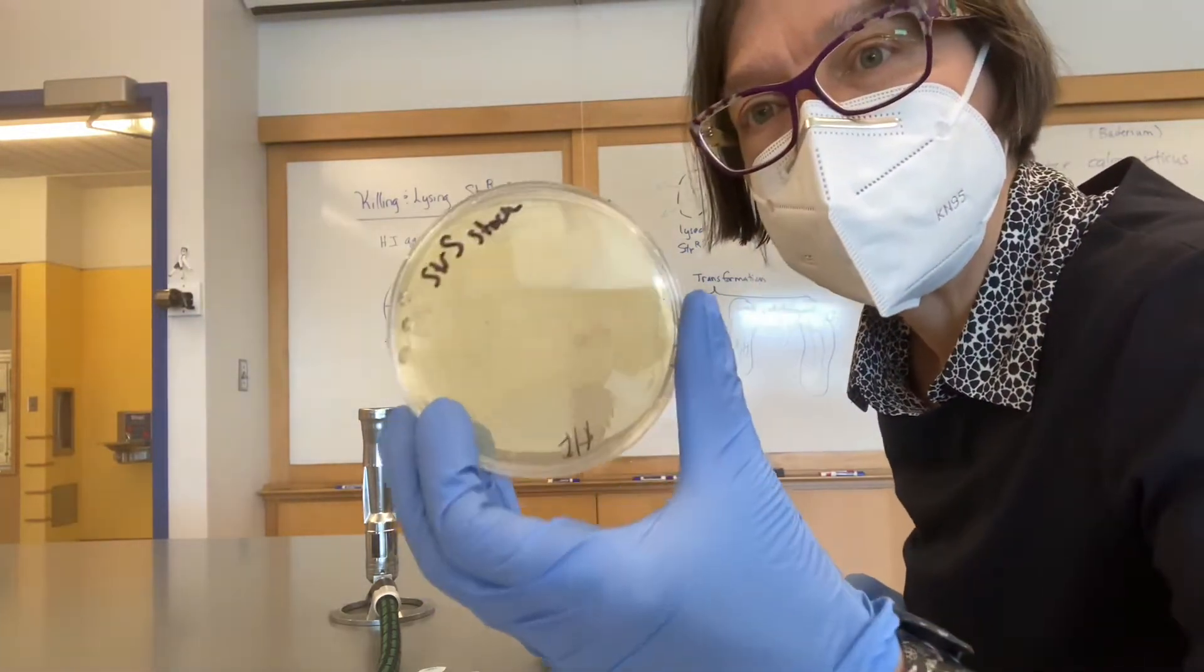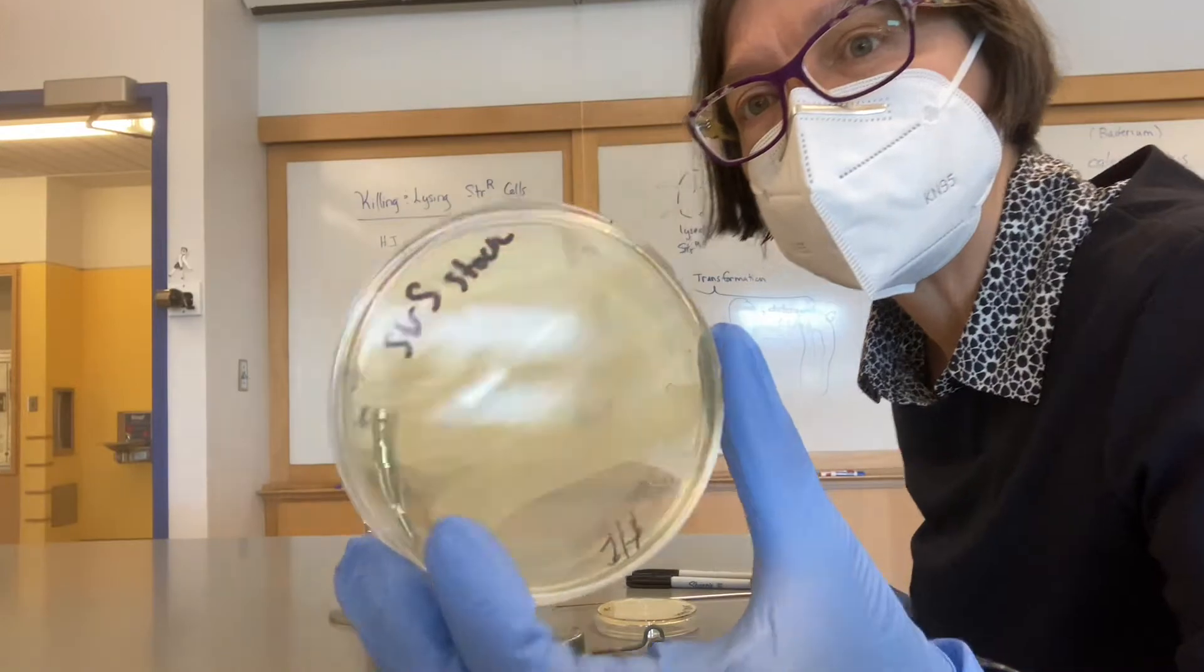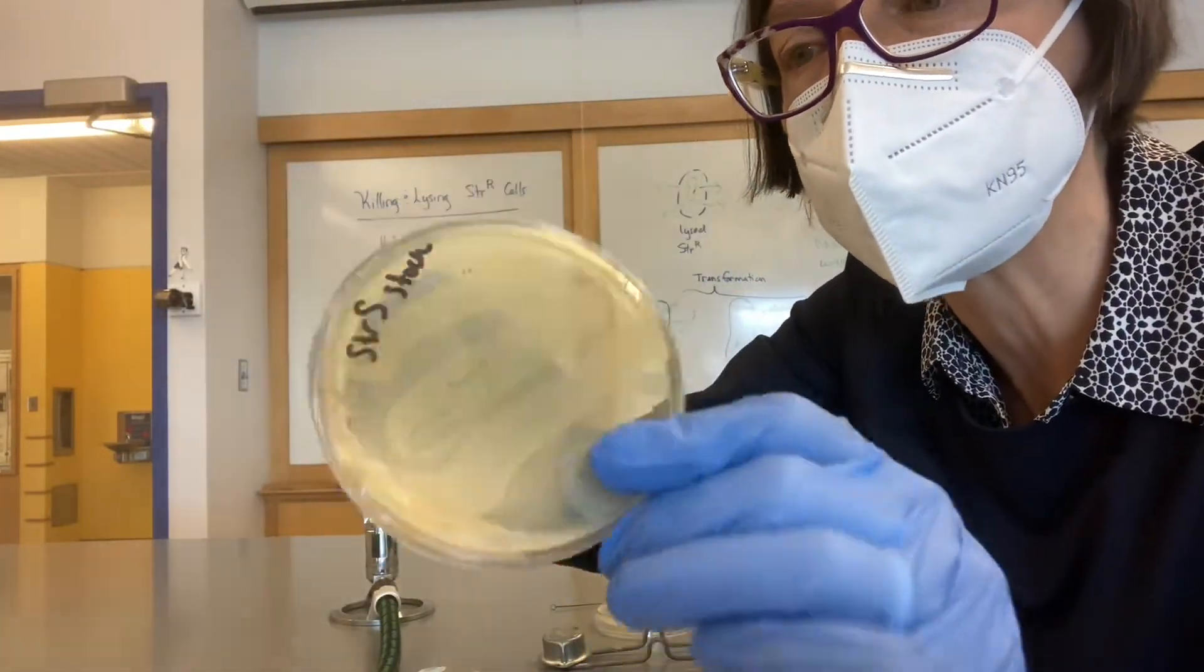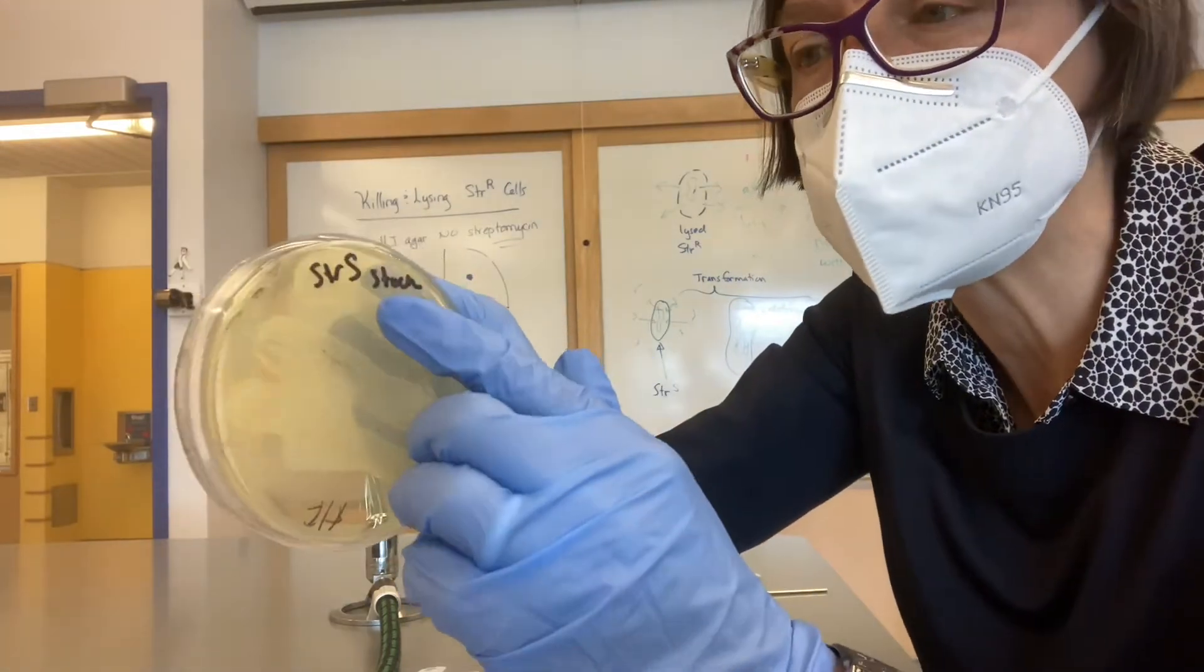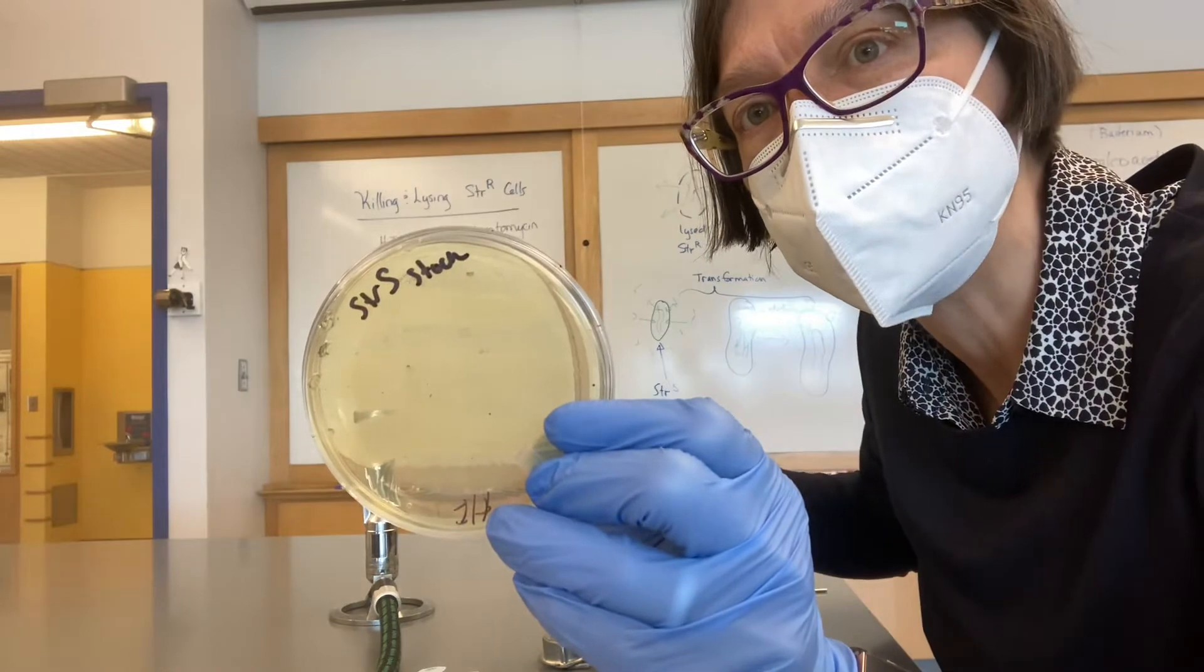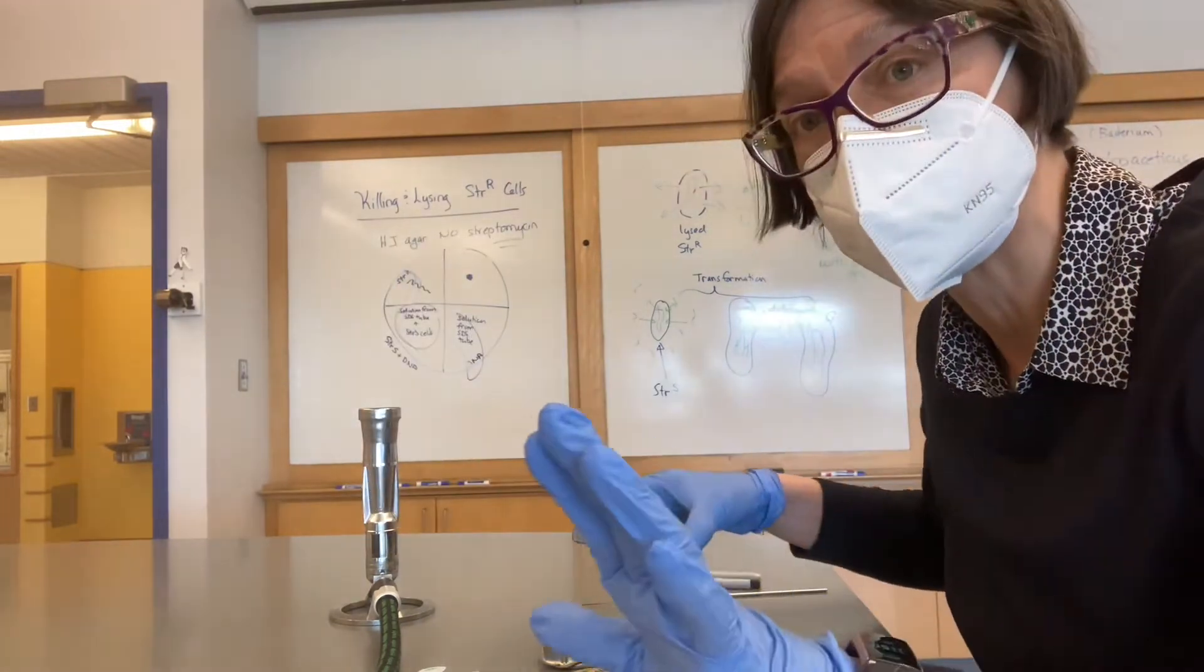We have a plate that has growing cells. You can see them kind of like the film there, of Acinetobacter calcoaceticus labeled STRS. That's the susceptible AAD2 gene lacking strain.